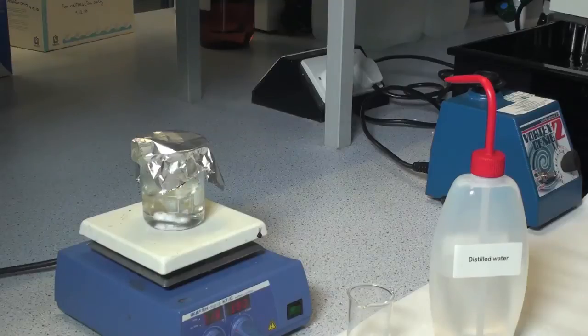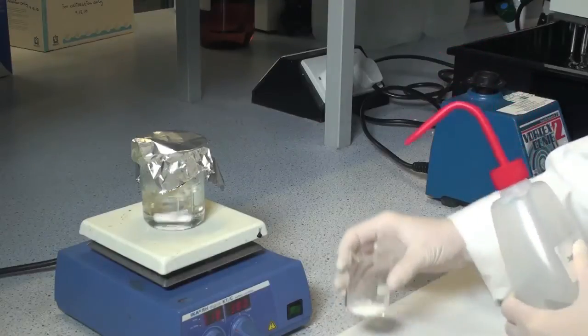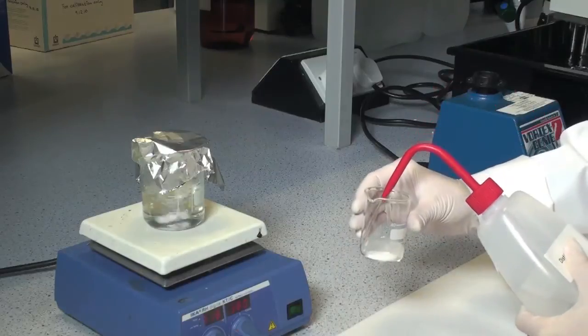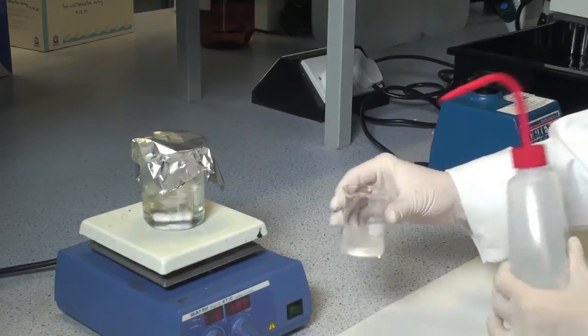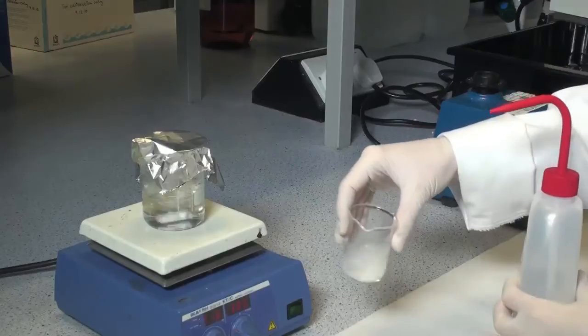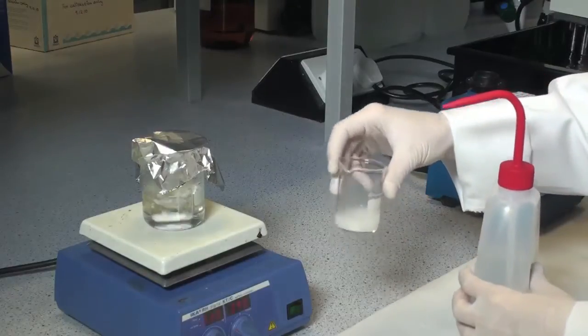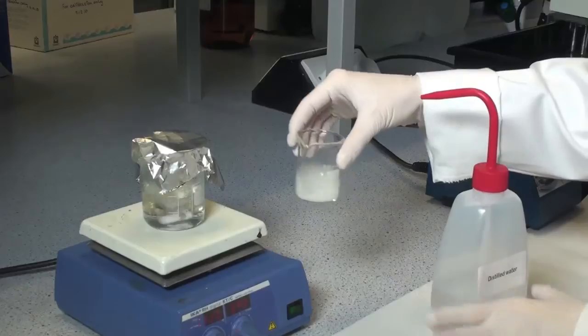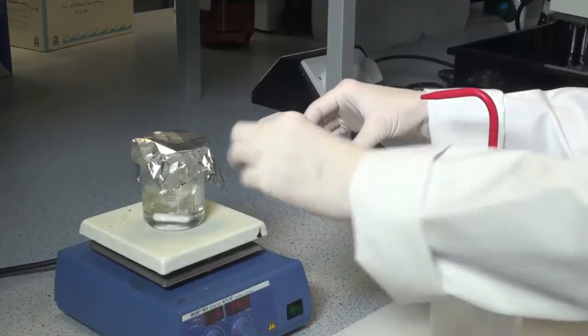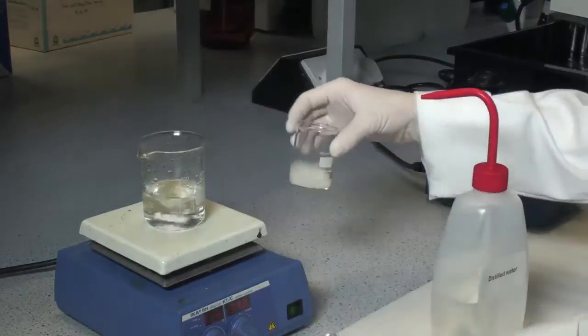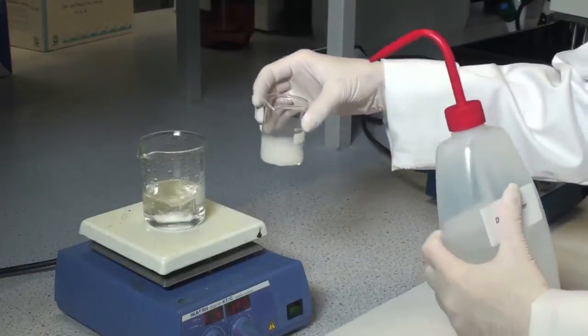Suspend 1 gram of starch in approximately 10 ml of distilled water. Then pour this uniform slurry into approximately 70 ml of vigorously stirring boiling water.